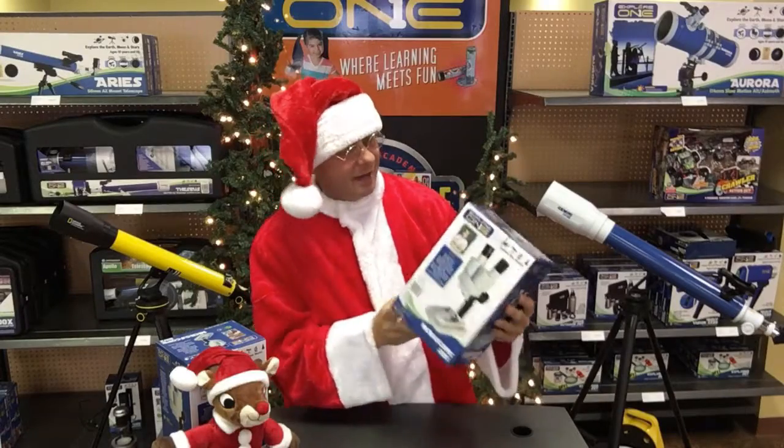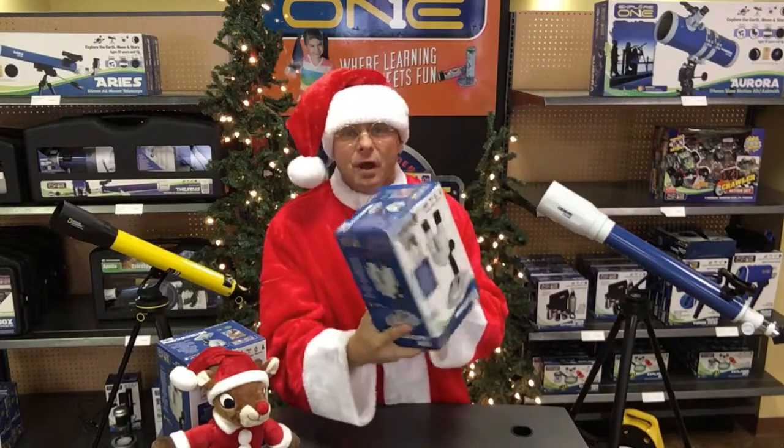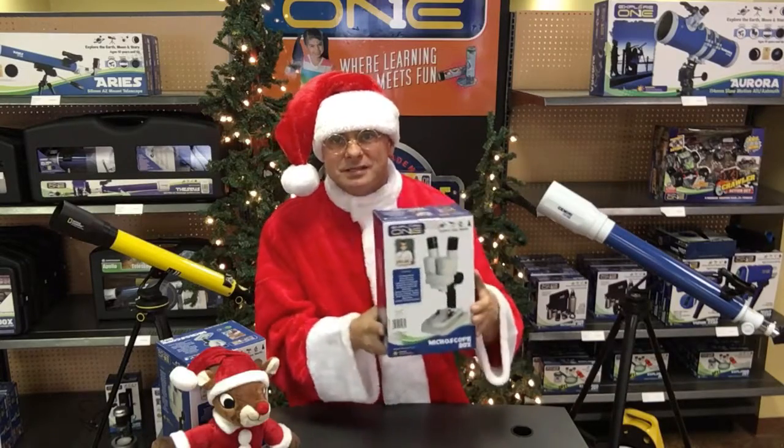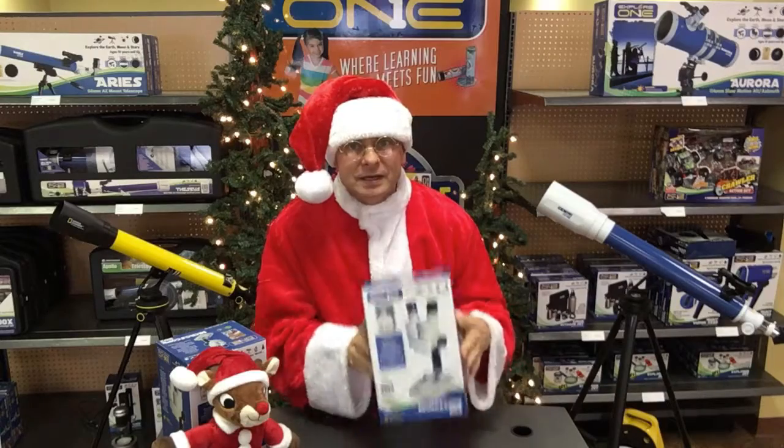Hi kids, ScienceSanta here, and we're going to look at the Explore 1 20 Power Binocular Microscope. When you're looking at binocular microscopes, everything looks like it's in 3D.